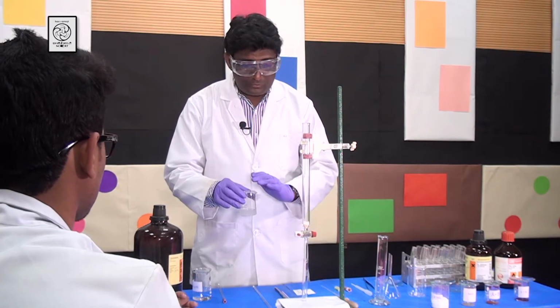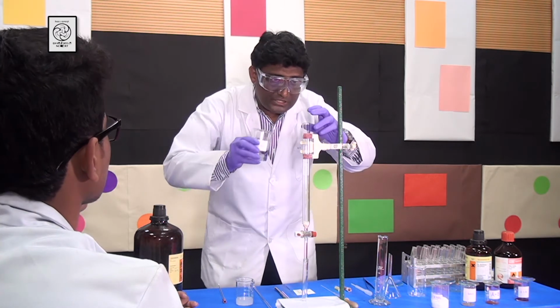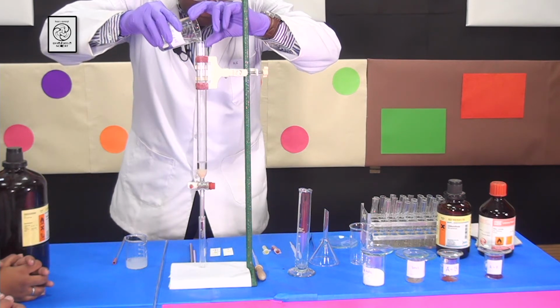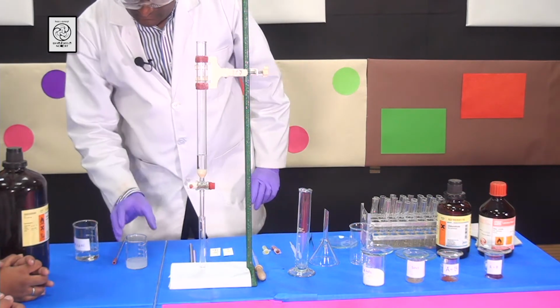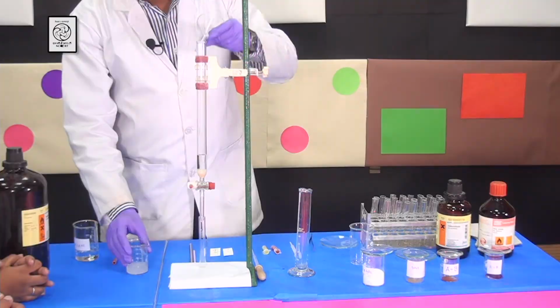So students, I have made the slurry of silica gel and I have to load this slurry into the column. But before doing that, I need to put a little bit of solvent into the column. I have to put it very carefully so that some of the solvent is right above the cotton. Now I am going to load this slurry of silica gel using a glass funnel.